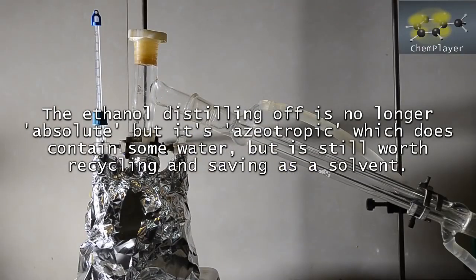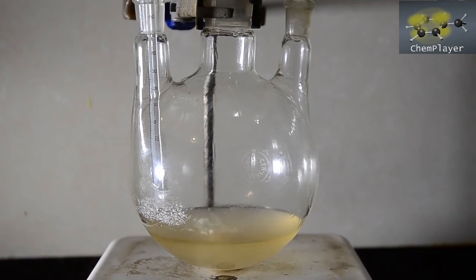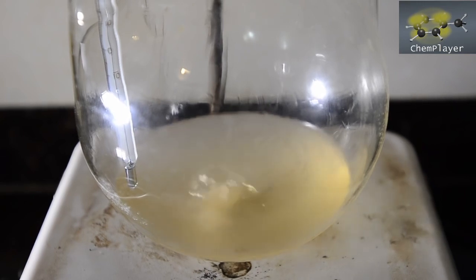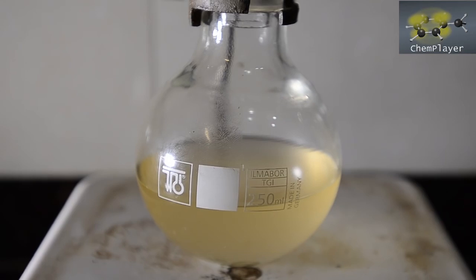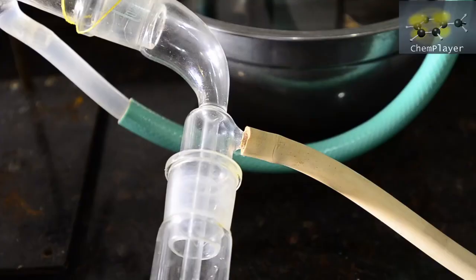Distillation of the ethanol took about an hour and a half. And then the temperature rose and we started to get water distilling off. Once the mixture was reduced down to about 100 ml, we changed the setup and replaced it with a smaller flask. And then, to remove the water a bit more gently, we applied a vacuum and slowly boiled this off.